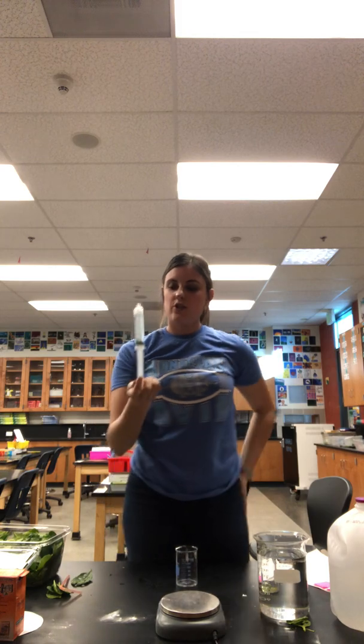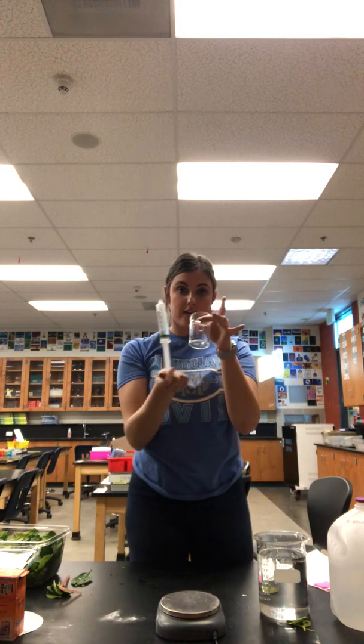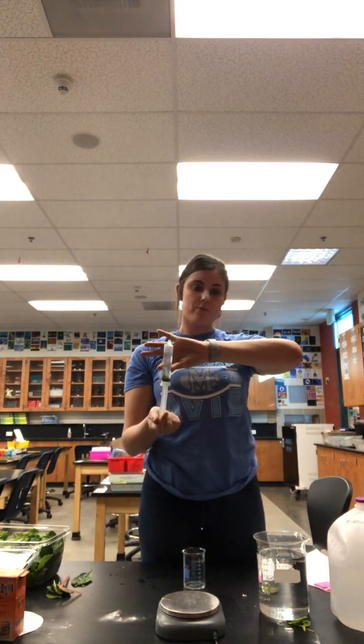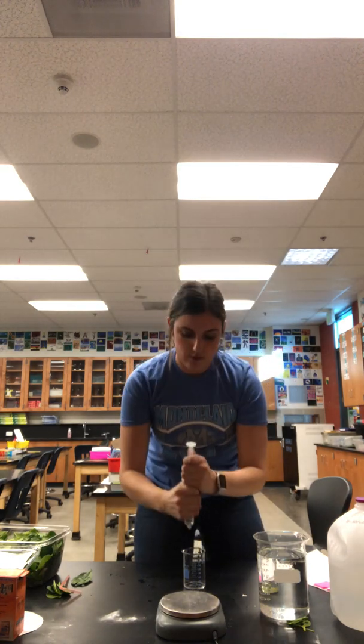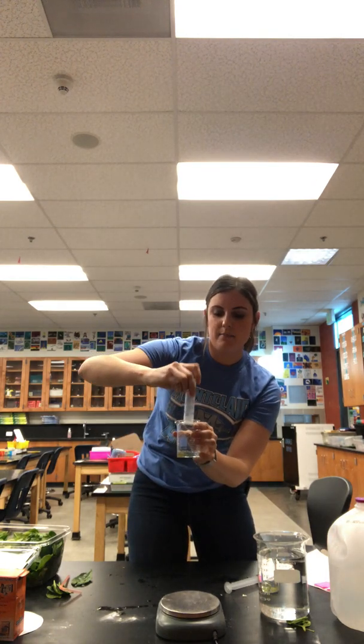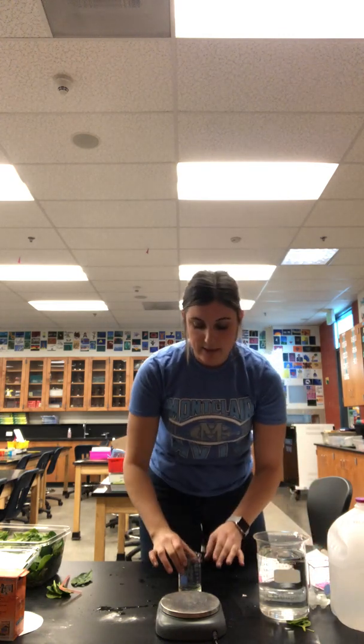Each group should have one syringe with their sunken leaf chads, and they should take their own small beaker with them. Assuming I am the light group, I am going to take the insides of my syringe and dump them into my beaker. And I'm going to go to a light source and put my beaker under the light source so that it can receive light.